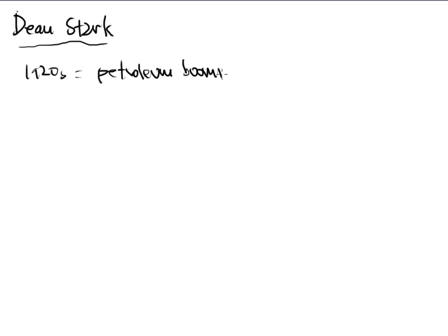So if you've taken a look at the ID of an unknown hydrocarbon lab, we've talked about petroleum there. If you've watched the fractionation lab, we've probably talked about fractionating pieces of crude oil and having them come off in bits and pieces. But here, the problem was petroleum. And the reason that I say the problem is because it wasn't the petroleum that was a problem. It was the contamination that was the problem. And we needed to get rid of contamination, right? We don't want any of the trash that's left behind.